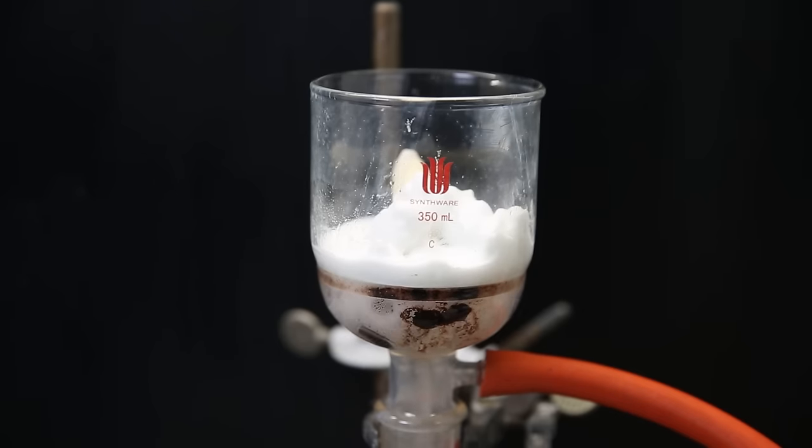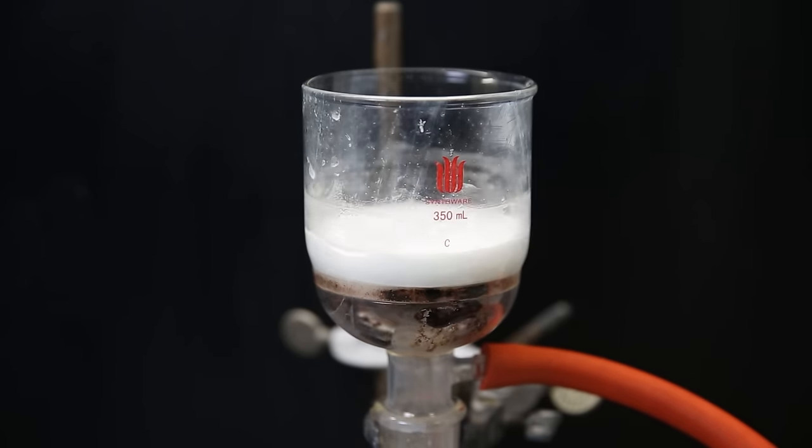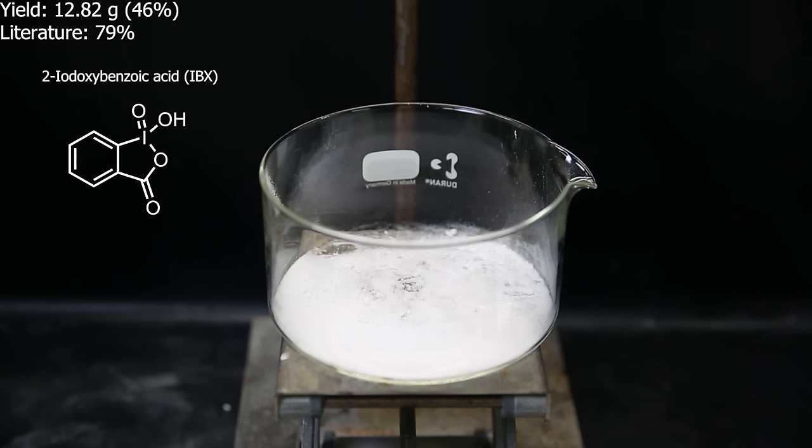I wash it with a bunch of water and some acetone, and after drying it in the oven, I am left with 12.82 grams of IBX as a white powder. This is a yield of 46%, which again, is probably because I washed it a lot more, but also because I used less water to dissolve the oxone, since I don't have 2-liter flasks or anything to heat that in.